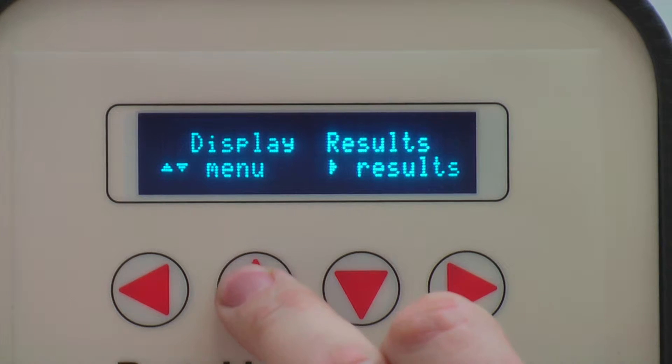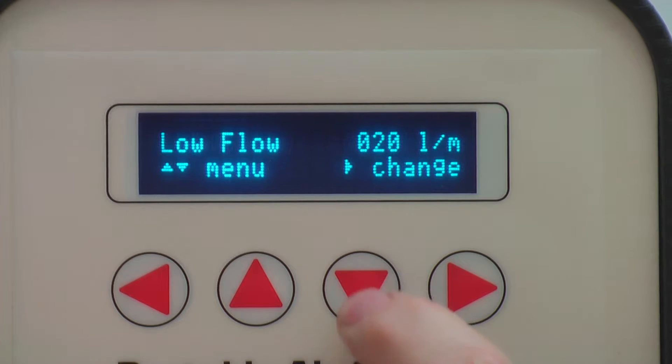The menu will then show menu or display results. Press up and down to access the config menu or press right to access recent results of test samples.